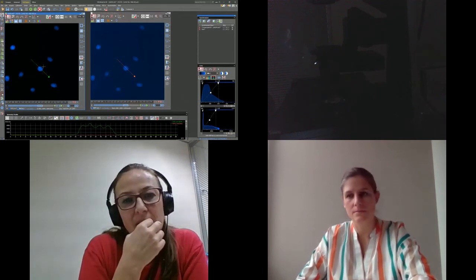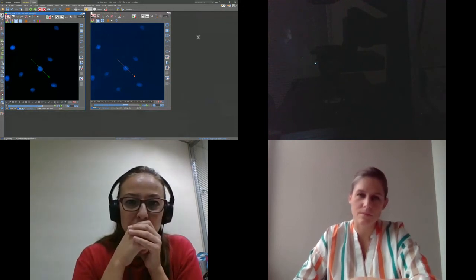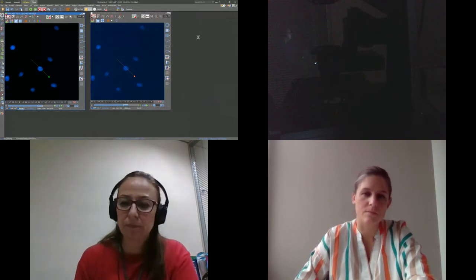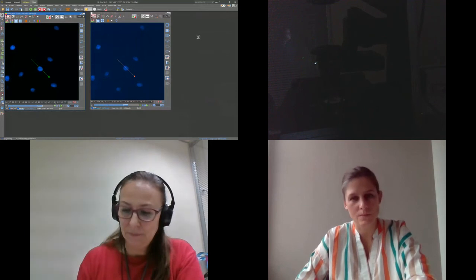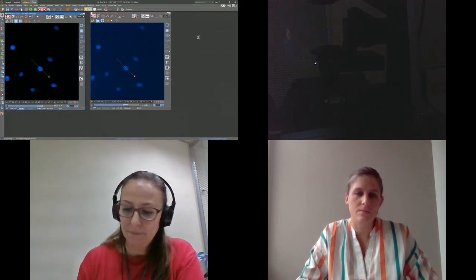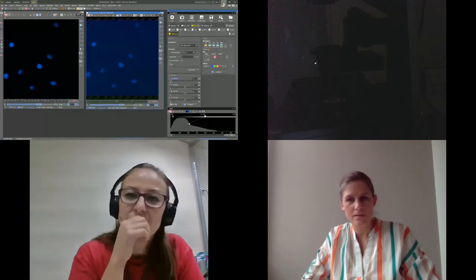or to make, for example, a tracking experiment. But the advantage would be that instead of using 50 milliseconds and 80% power of my 385 LED, as I told you here, we would simply use 500 microseconds and 4% of my LED. So I think that this is quite a powerful tool in order to design our experiments, and we get very nice results. You can see here. So I'm going to finish now my experiment. I hope you enjoyed it, and we can now start with our questions.